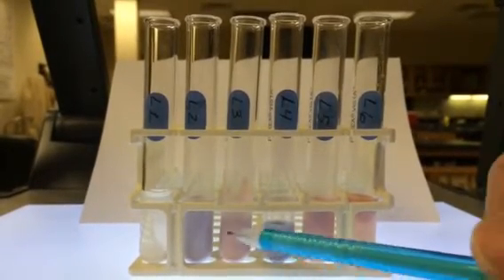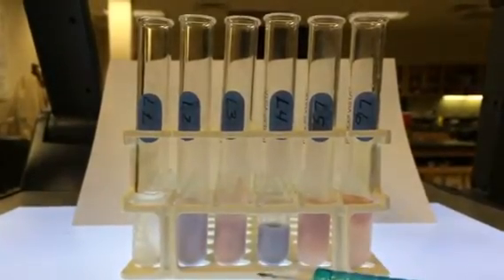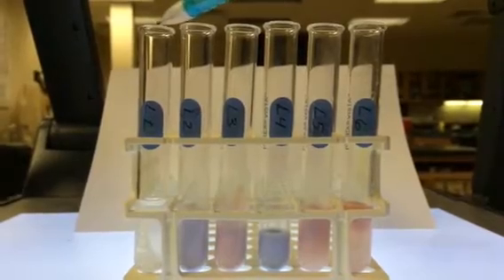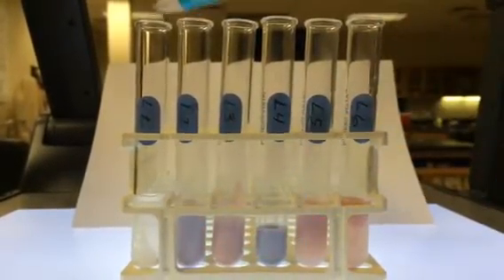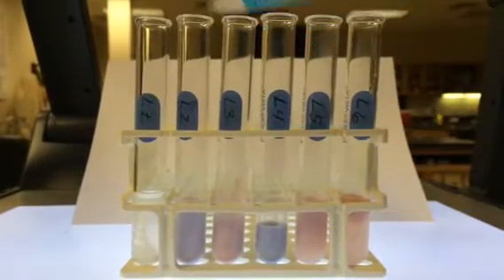So that's all these are for, just to show you what the results might look like. Now let's look at the other results. Test tube L1 was just lipase and water, so that doesn't really show you much, just that lipase is not changing the color of the solution.